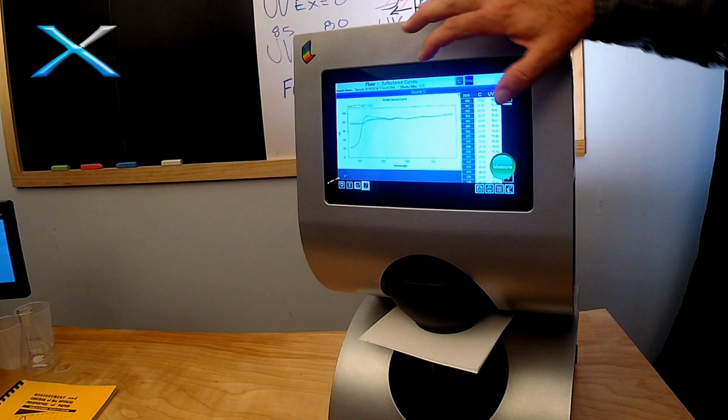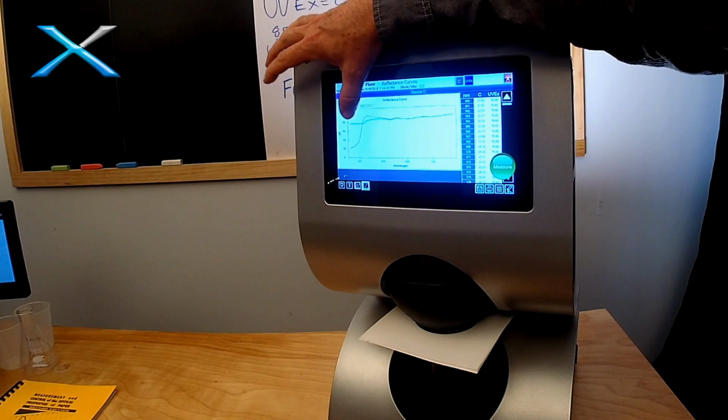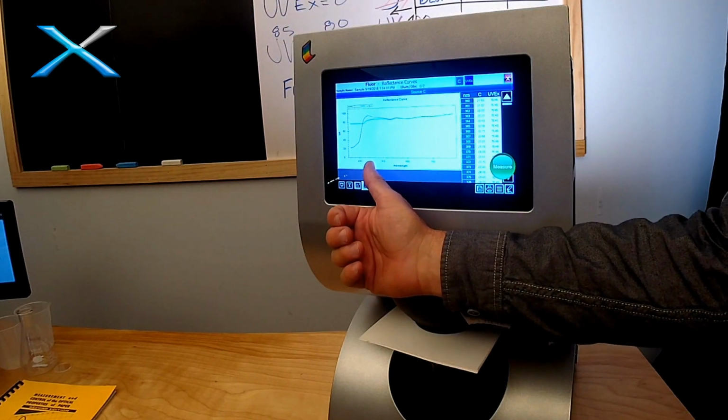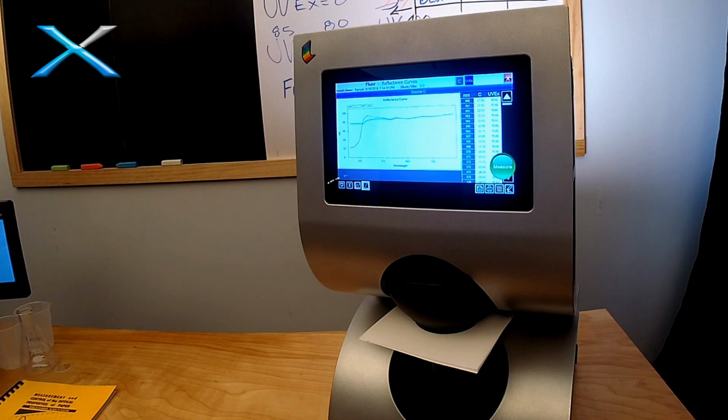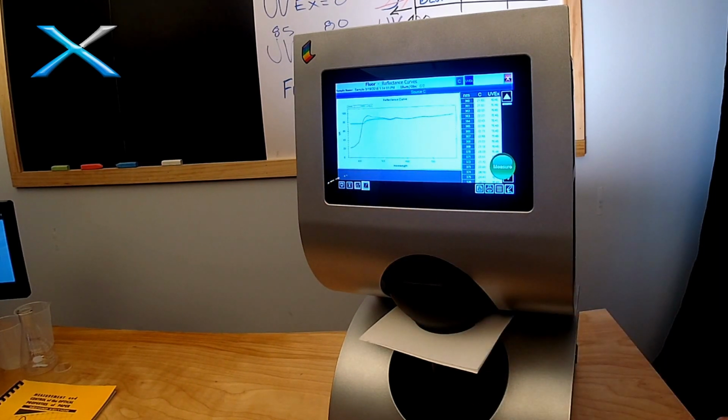If I back out of that, you'll notice on the UV excluded line, a straight line going across. The standard calls that at 420 nanometers, where the UV cutoff filter is, you take whatever that data point is and you just extrapolate that out through the rest of the spectrum. So that's why you have that odd line going right there.